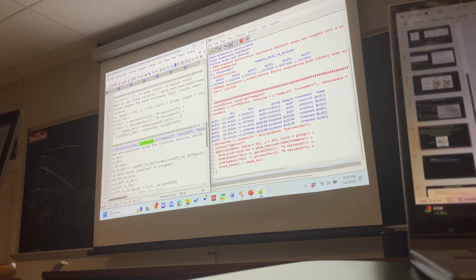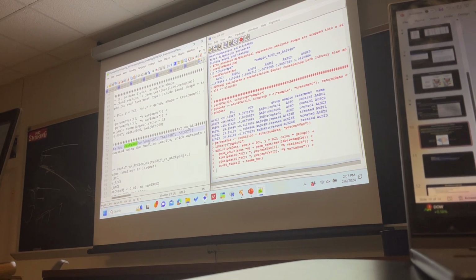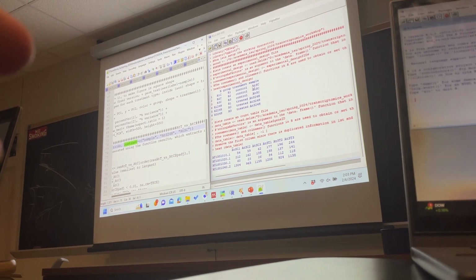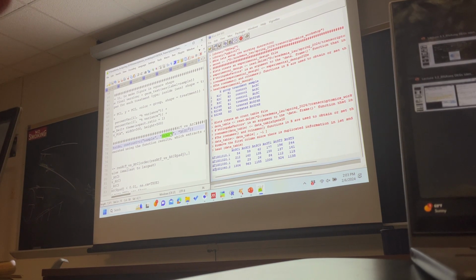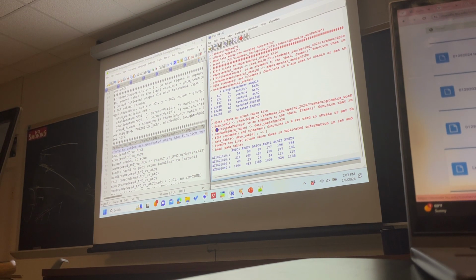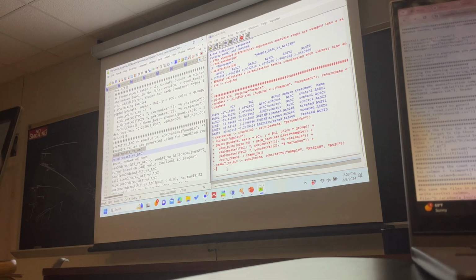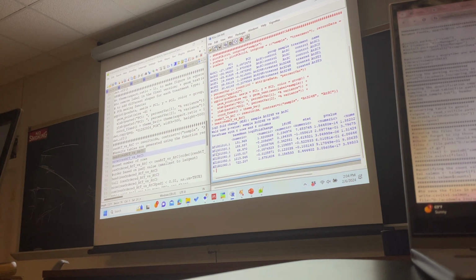The results function calls for the contrast, and then it will basically compare the two samples. You asked for the sample comparison. The sample comparison basically comes from your experimental design file, and you asked to compare this 24-hour sample with the control sample here. That's what it did here. So if you just run this code here, it will calculate now, and then you can see how this object, what it is storing under this. It seems it has some type of table here.